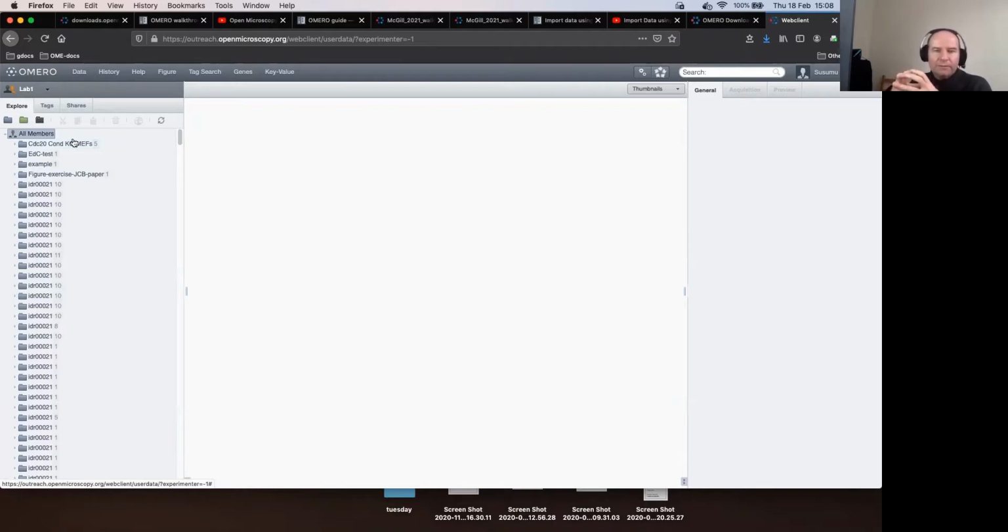Also, the owner of the group is typically in the real world the PI, the group leader, which you just mentioned, and all lab members have read access to all data within that lab. That is not necessarily true. But in this case, on this server, I also see your second import, for example. That's correct. You will see everything, so let's just explain that properly.